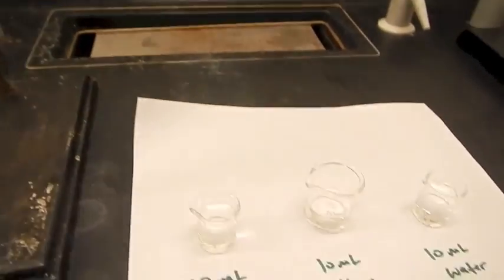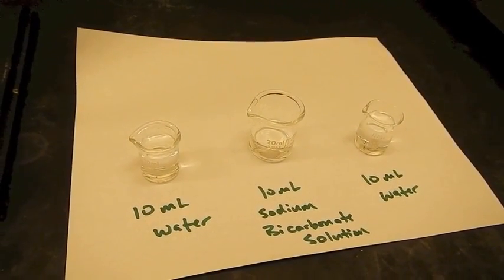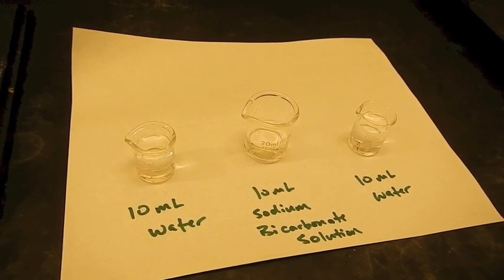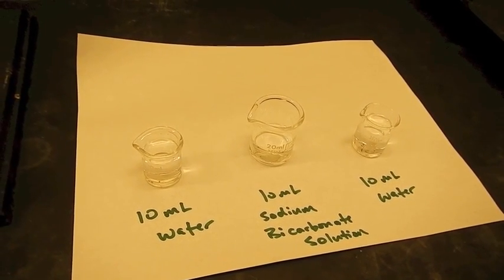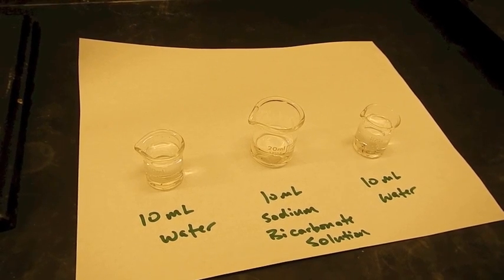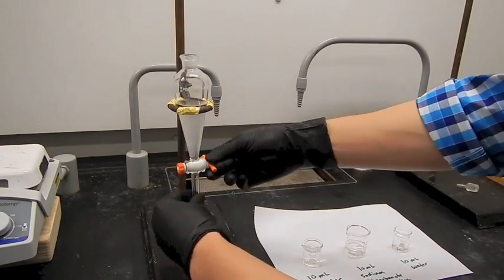So I've got my washes ready to go, 10 milliliters of water, 10 milliliters of the sodium bicarbonate solution, and 10 more milliliters of water. You want to make sure you get all of this stuff ready to go before you start the extraction process, because you want to do the extraction process as efficiently as possible. So I'm going to start the extraction process.